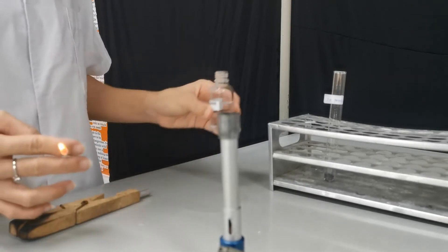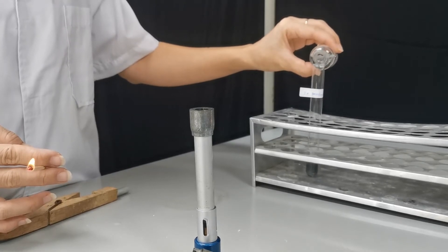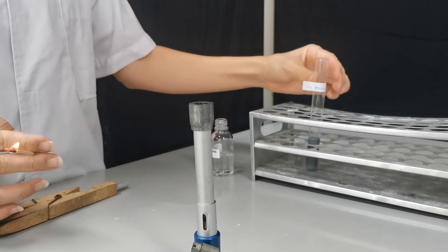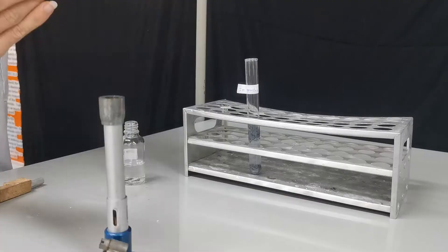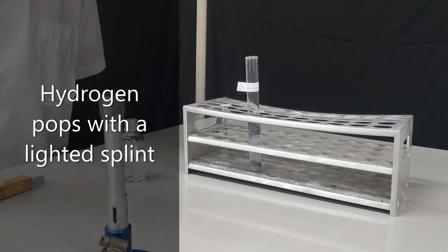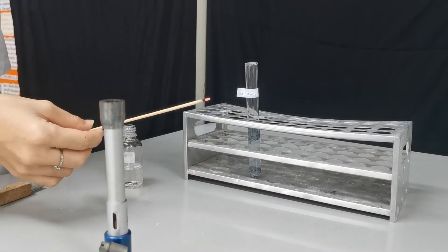We can make hydrogen by reacting a moderately reactive metal with hydrochloric acid. Here I have zinc powder, and you can see the fizzing happening. When enough hydrogen has been collected, we introduce a lighted splint and it will create a pop sound.